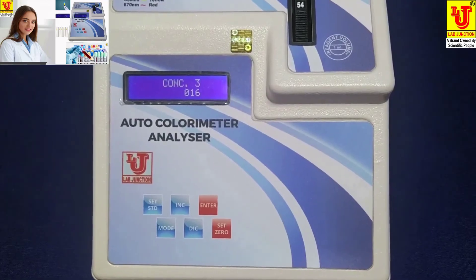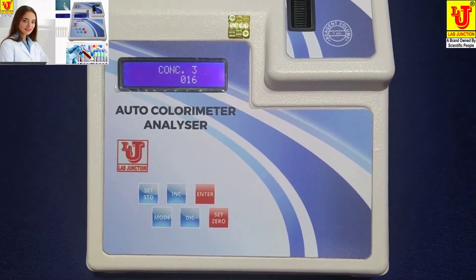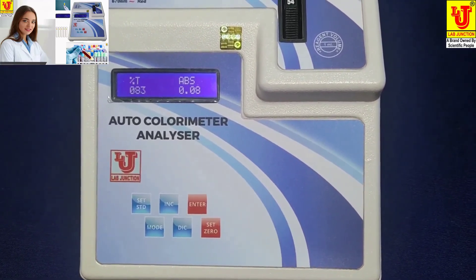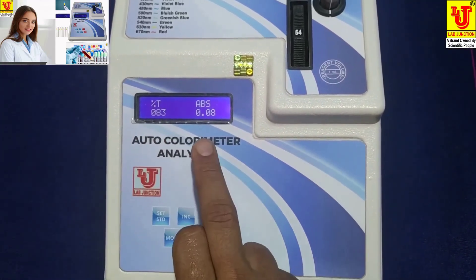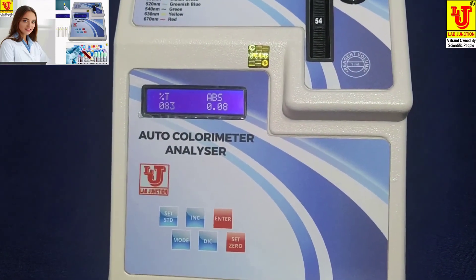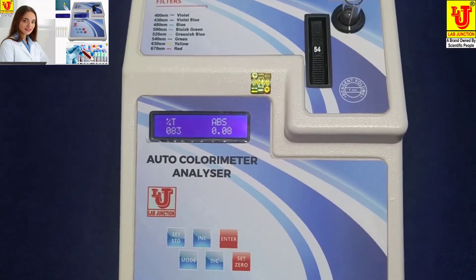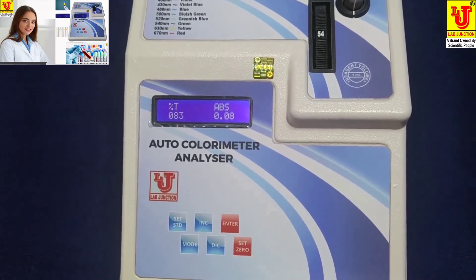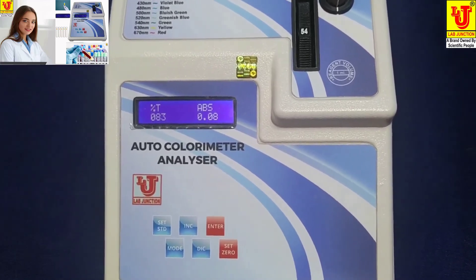This way you can set known concentrations and find unknown concentrations of your samples. In the main display for this sample, transmission is 0.83 and absorbance is 0.08. This is the way to use the disc colorimeter. These are used mainly in pathology labs, in colored dyes analysis, factories, and many other applications.